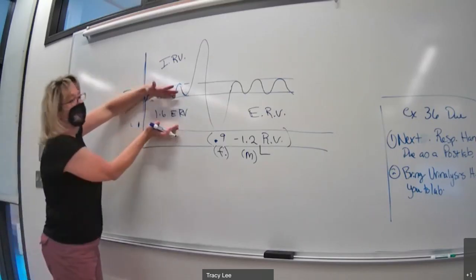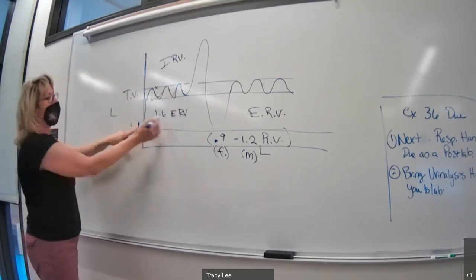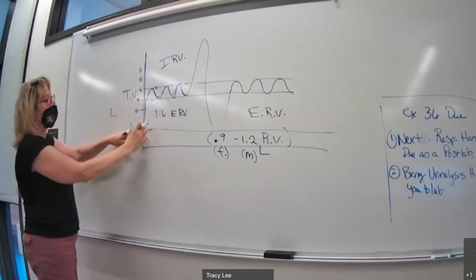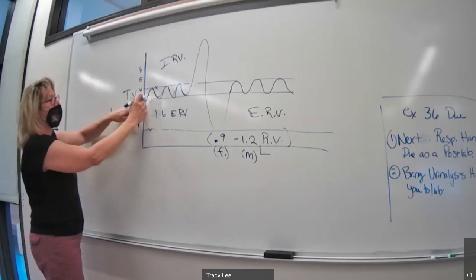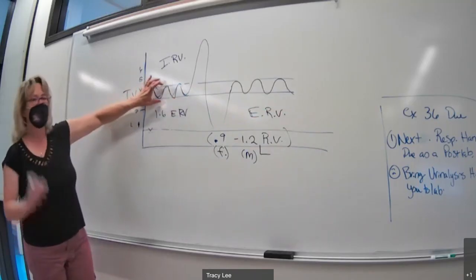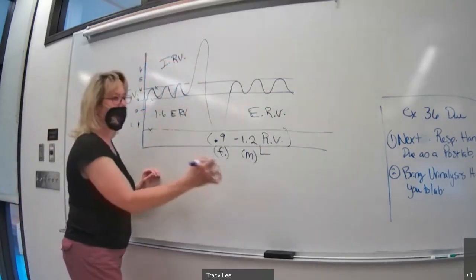So that's this zone right here. I have to add that zone onto my residual volume. So I'm going to go from 1, and let's say I did my values over here, 3, 4, 5, 6. I'm going to add 1.6 to 0.9, and that would be the top of my expiratory reserve zone. And then I would add the max value for my tidal volume, and then this up here. Then I would go back and add my lines.